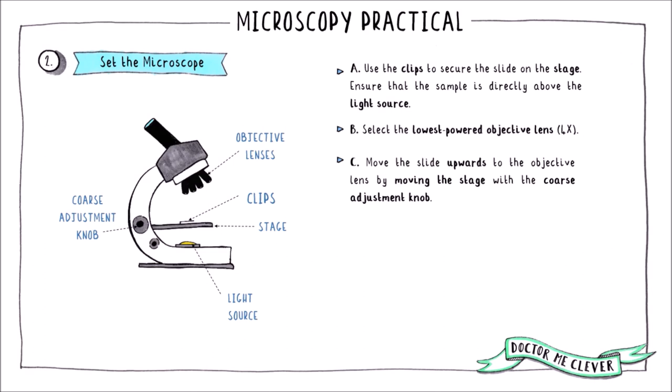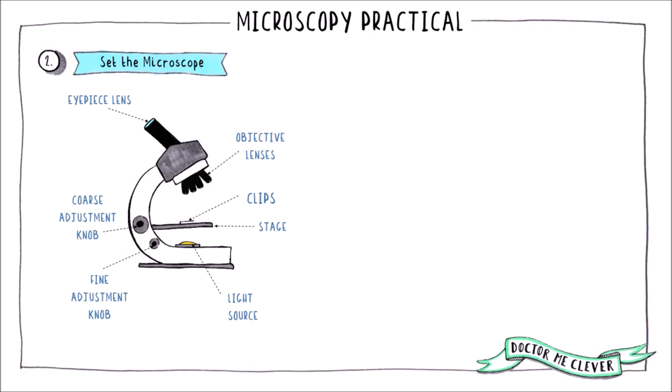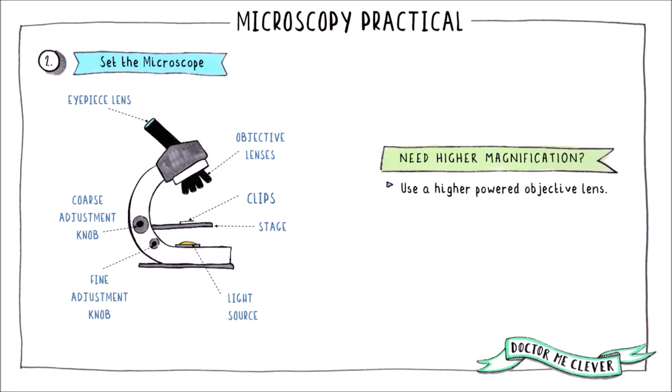Use the coarse adjustment knob to move the stage upwards towards the objective lens and stop just before the slide touches the lens — you don't want your slide to hit the lens as it could cause damage. Now look through the eyepiece lens and use the coarse adjustment knob again to move the stage back down gradually towards the light source. Stop when the specimen is almost in focus.